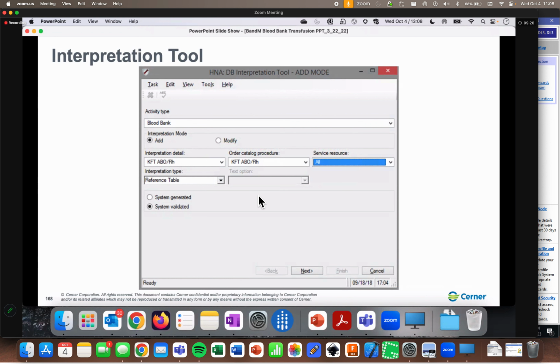So that's what I'll do. If I'm not sure, if someone else has started the build before, I'll just switch it over to modify mode and have a look. It's very similar to just using an open menu in another tool. I'm like, I'm pretty darn sure I started that PowerPoint yesterday. And so I go out and I say, open PowerPoint. And lo and behold, there's the one that I started, just hidden away in some folder. So same sort of idea. If I don't know if it exists, I'm not sure that it's saved, switch it to modify, see what comes up.